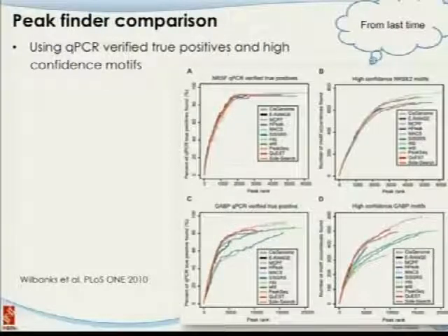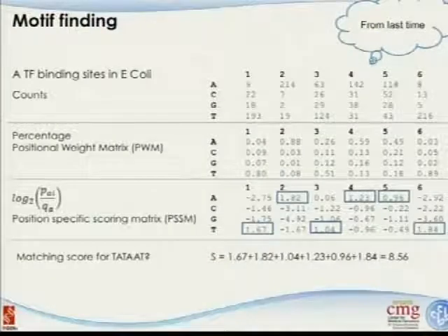This is one paper published last year trying to evaluate the different approaches. I'm not going to go into detail on the evaluation results, but keep in mind that when you select the algorithm to use, you don't have to write your own program, but when you pick, go back to the paper and see which one fits your strategy.